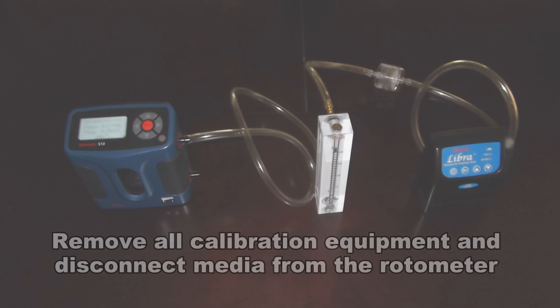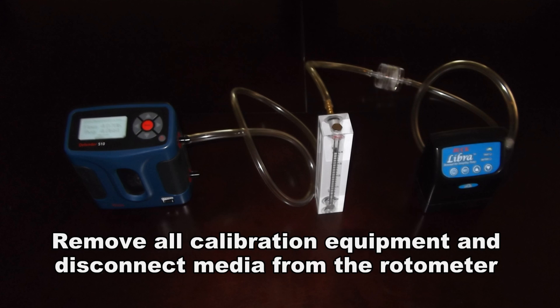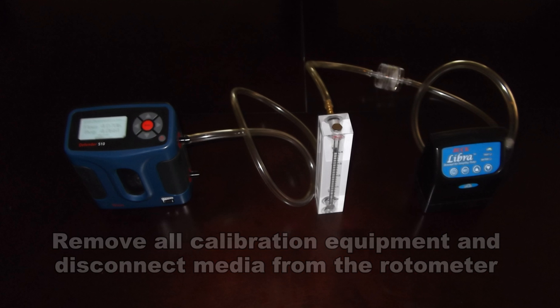Once calibration is confirmed, turn off the pump, disconnect the media from the rotometer, remove tubing and or adapter from the sampling side of the media, and you are now ready to begin sampling.